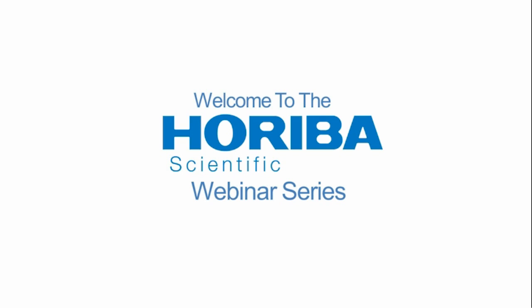This webinar will focus on our new tool, OpenFluor, which facilitates qualitative interpretation of both fluorescence excitation and emission spectra and components derived from parallel factor analyses. OpenFluor also lets you upload published spectral data sets to the database and compare unpublished data sets to the published sets to evaluate spectral matching and component identification.